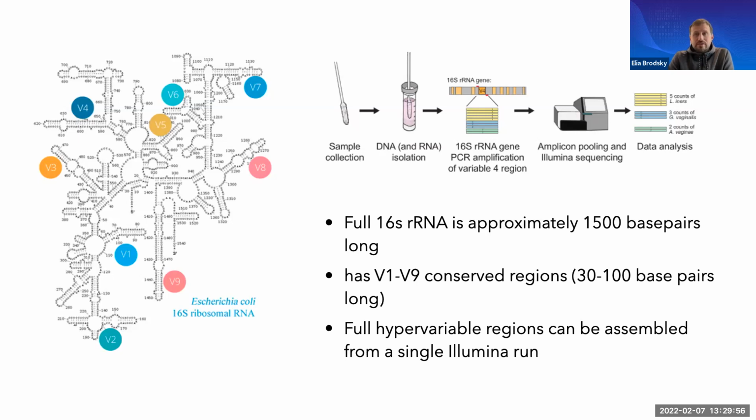While the entire 16S sequence, approximately 1,500 base pairs long, allows for comparison of all hypervariable regions, it can be prohibitively expensive for studies seeking to identify or characterize diverse bacterial communities. These studies commonly utilize the Illumina platform, which produces reads at rates 50-fold and 12,000-fold less expensive than 454 pyrosequencing and Sanger sequencing, respectively.